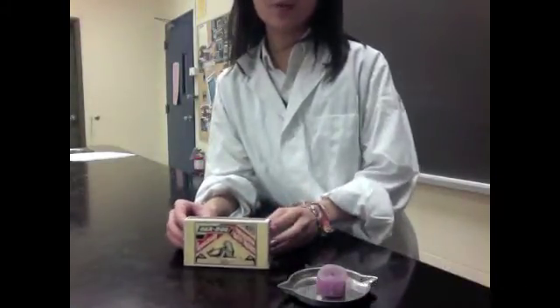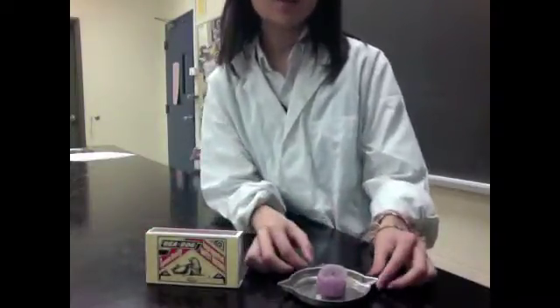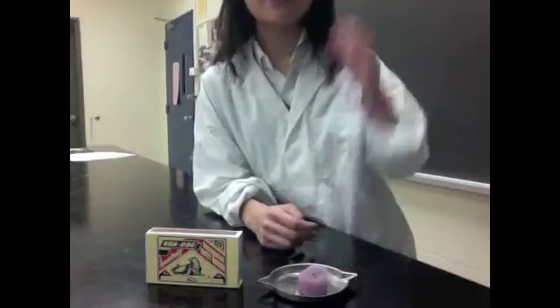For this experiment, we're going to need ingredients such as these matches, which comes in a matchbox like this, and also a candle, which is made of wax. The formula for wax is C25H52.